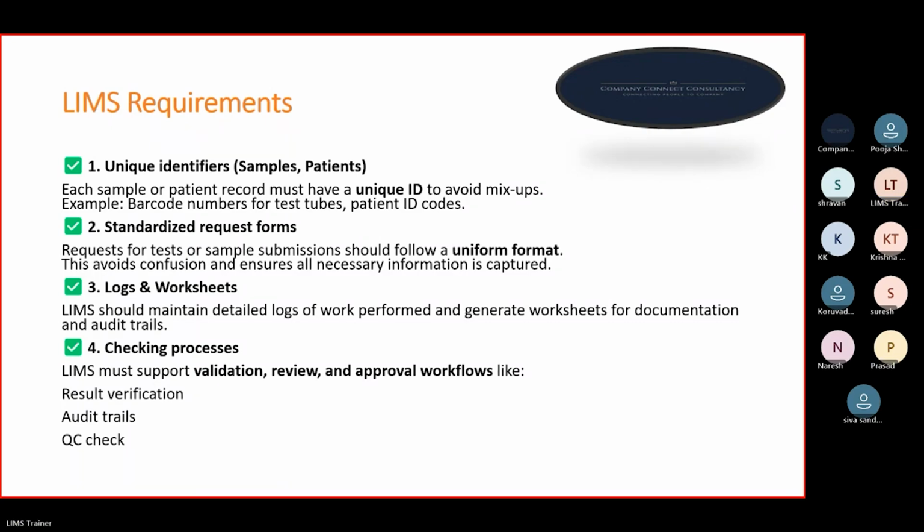You will test whether it is working properly, whether there are any gaps in the user requirements, whether LIMS is working as expected, providing accurate data, accurate results, and giving the correct certifications. You will check in the development environment, and after that move to the quality or validation environment.